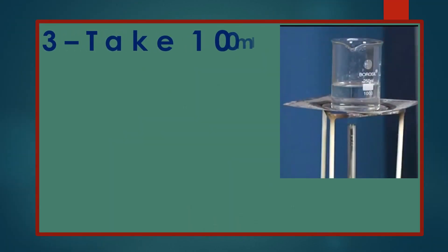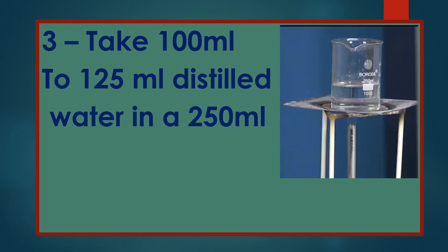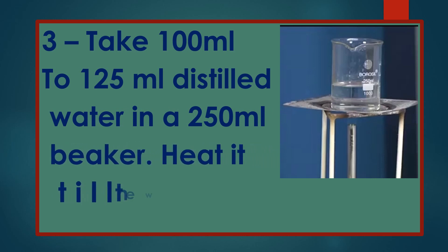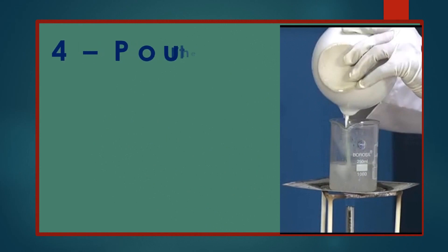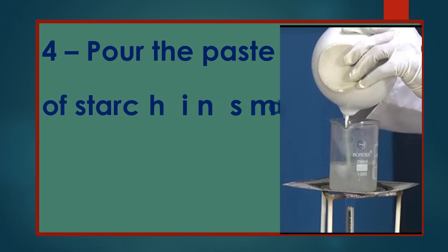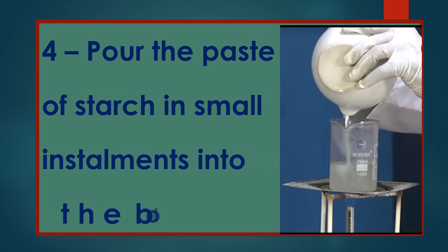Take 100 ml to 125 ml of distilled water in a 250 ml beaker. Heat it till the water starts boiling. Pour the paste of starch in small installments into the boiling water.